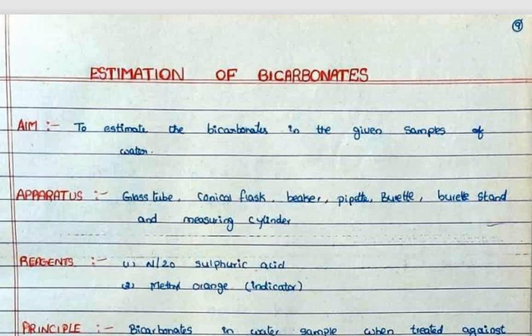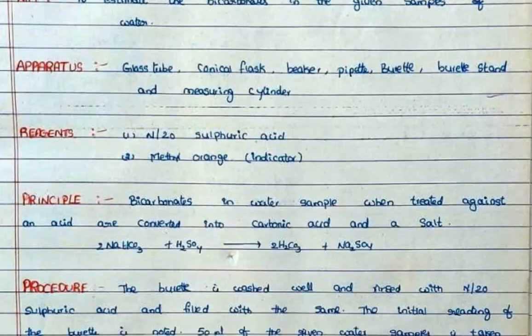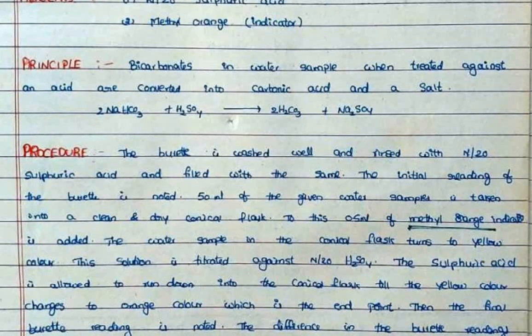Next, reagents: N/20 sulfuric acid and methyl orange.